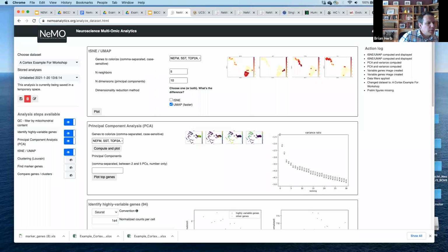How many cells can your tool work with? It certainly handles tens of thousands of cells pretty well. If you have a specialized use case, we can always reach out. Sometimes with the computational limits, all we have to do is ramp up how much resources we're asking from Google itself. So if there's a special data set that we want to process, we can certainly work with you on that. But generally right now, the data sets in the tens of thousands work very well with this tool. Tens of thousands of cells.